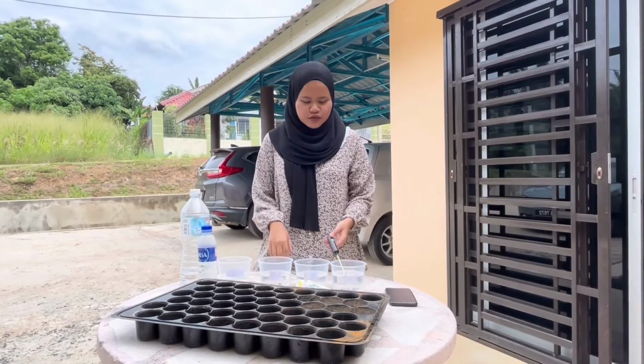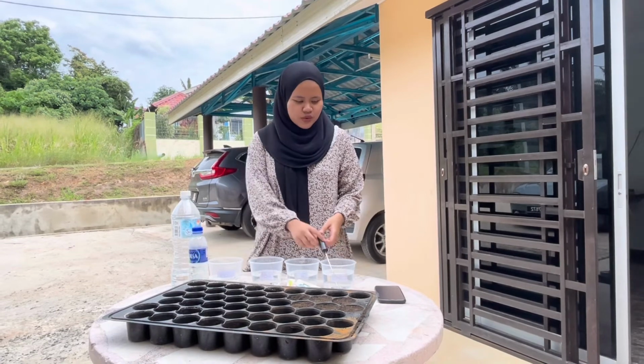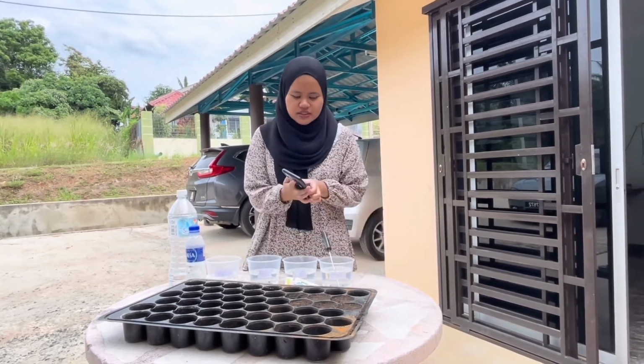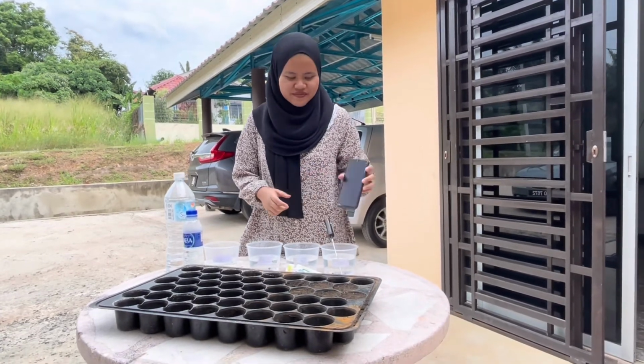And then we have to soak these 3 seeds in the allotted time. We can use the timer on the phone to make sure the time is right.